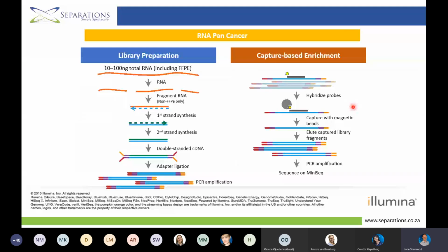So I also just wanted to discuss the library prep workflow itself on the pan-cancer, because we haven't actually discussed any library prep workflows. But basically, a lot of our library prep workflows that look at targeted genes use enrichment-based bead capture technology.